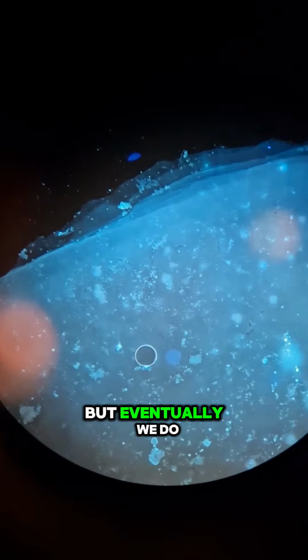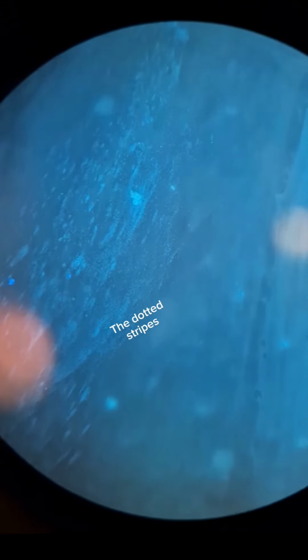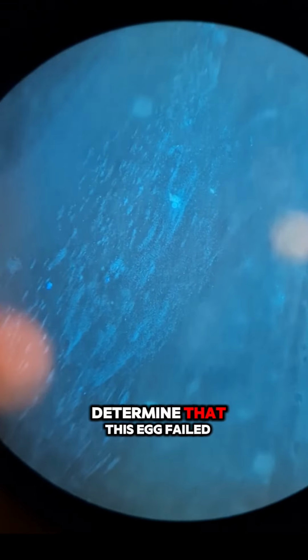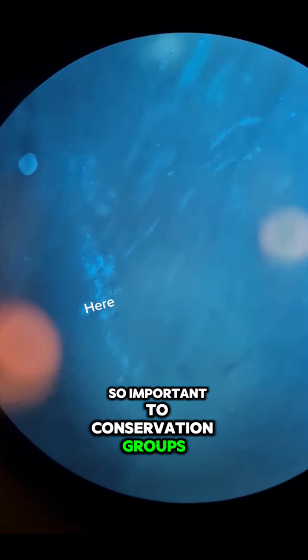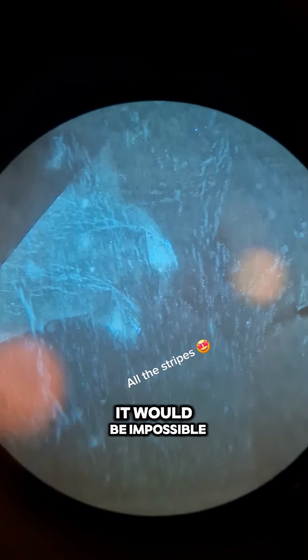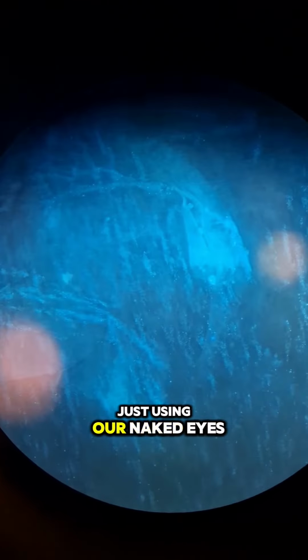But eventually we do indeed find embryonic cells, and we can now determine that this egg failed because of early embryo mortality. Information like this is so important to conservation groups because without this method, it would be impossible to conclusively determine why this egg failed just using our naked eyes.